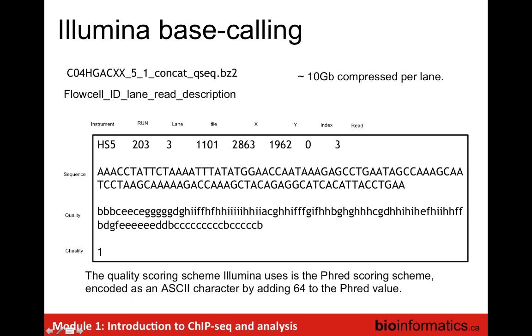Anyway, so then the tile, right? So tile, and then X and Y coordinate, okay? So putting all these things together, concatenating them all together, gives you a unique ID for that read.